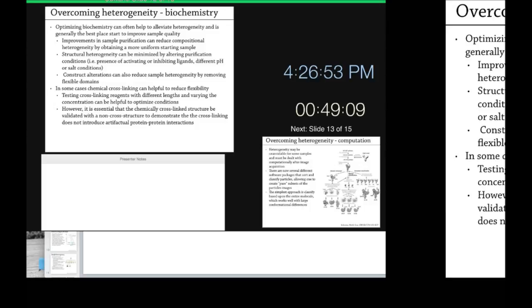The other thing is to go back and do construct alterations. This is something that crystallographers have spent a lot of time on, and for their samples, because they need to form a crystal, they spend a lot of time, and sometimes this is essential. You need to cut and paste and do a lot of piecing together to get a viable construct. But with EM, we try to get the most native conformation possible. And so sometimes you can get a lower resolution reconstruction of the entire construct without doing too much molecular biology. But then if you know there's a region that's always flexible and is sometimes falling off, sometimes being a real problem, then you can cut that, or you can trim it down to try to eliminate some of the flexible loops, and that may give you a higher resolution reconstruction. But because you have the full reconstruction map, you can now use the two to make a better understanding of what it is, and you have good validation that your reconstruction does faithfully represent the overall structure.